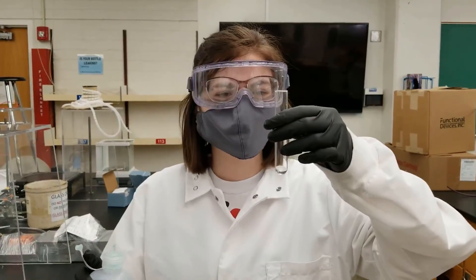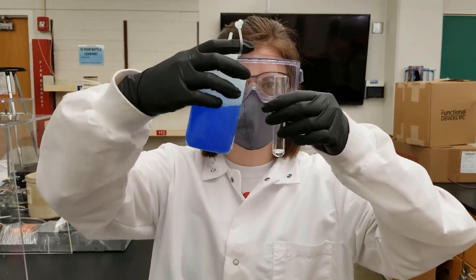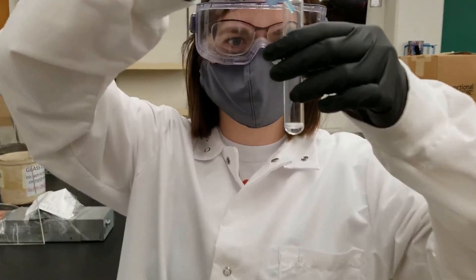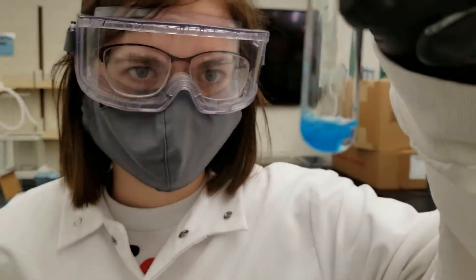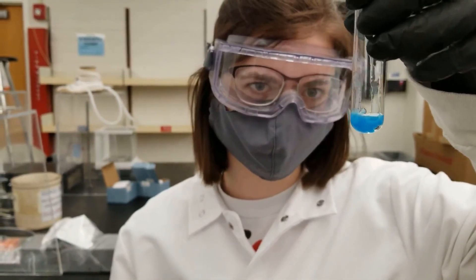This is experiment 6b. This is sodium hydroxide and we are going to add some copper sulfate. You can see it is kind of like a blue precipitate that's formed here.